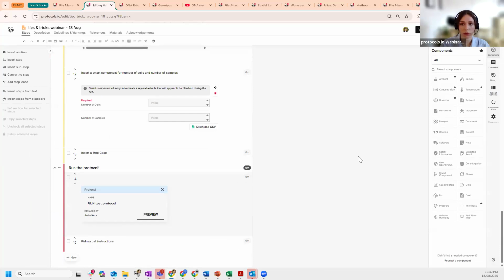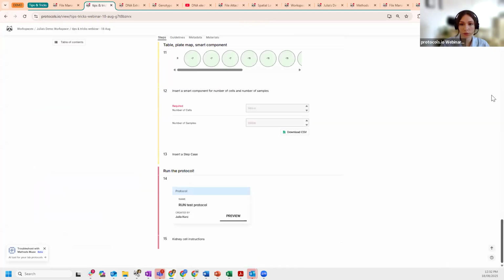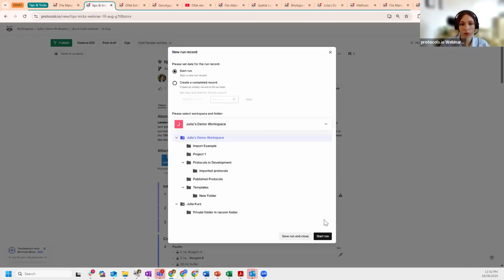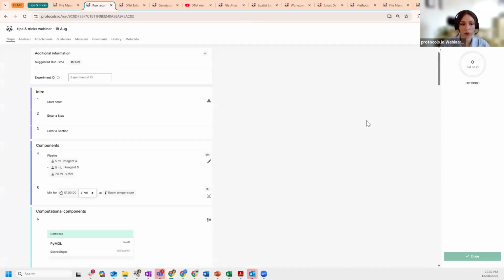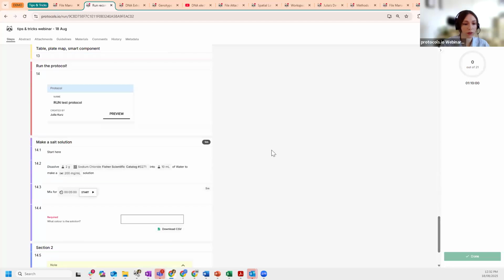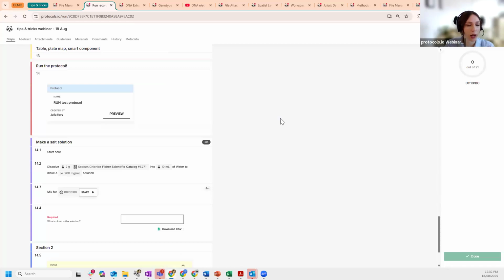All right. Let's try it again. There we go. Yeah, the step case must have interfered with that. I'll let our team know that that happens.